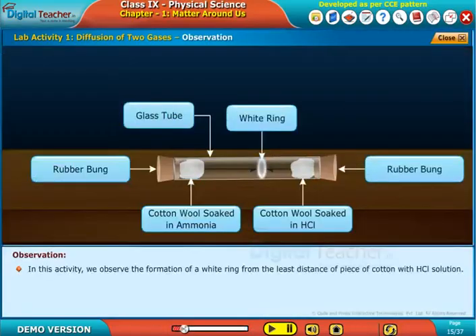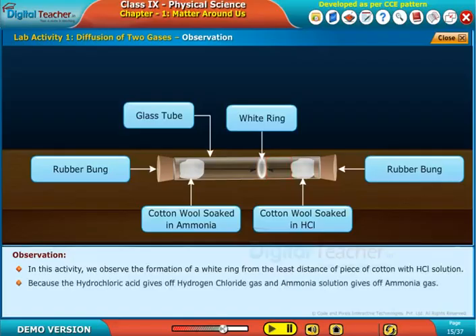In this activity we observe the formation of a white ring from the least distance of piece of cotton with HCl solution, because the hydrochloric acid gives off hydrogen chloride gas and ammonia solution gives off ammonia gas.